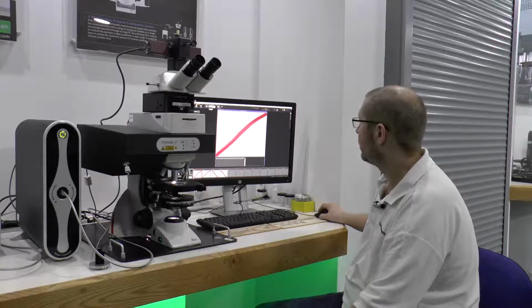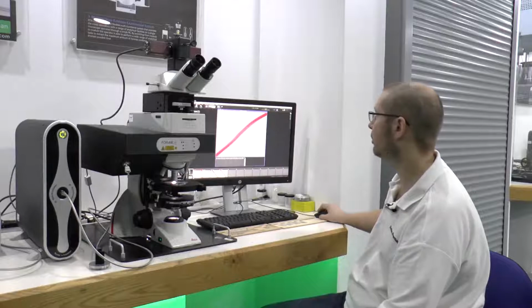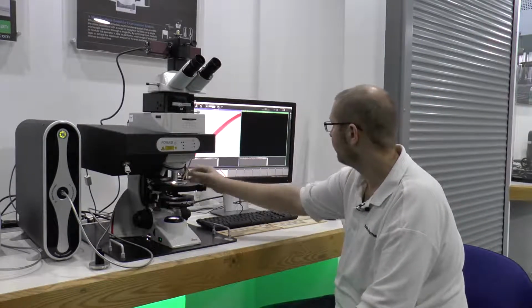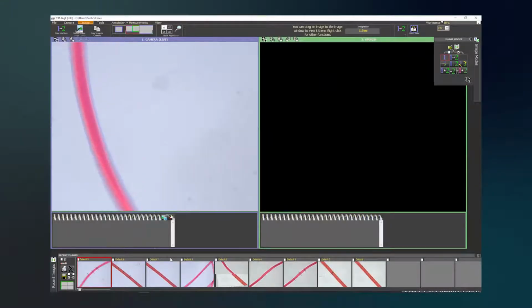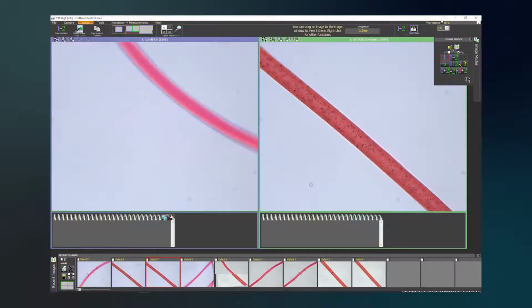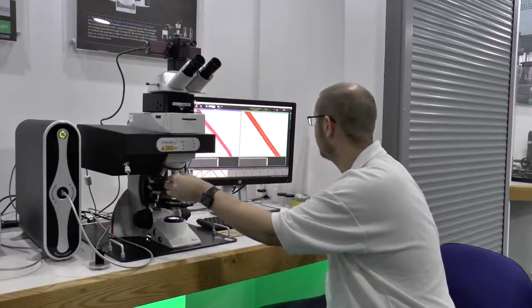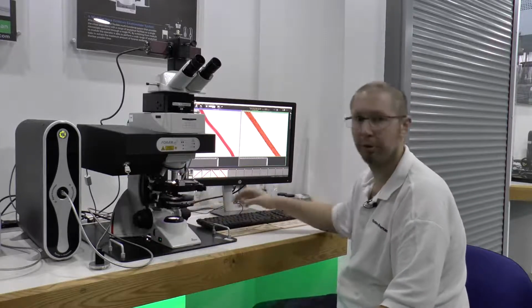And using the software, we can now do a side-by-side comparison as well of these two fibres. So we can switch to side-by-side. We can keep this one as our live measurement if we want, and then we just need to drag and drop our sample from the first examination over into our second window here. Because we've got it live, we can reposition our sample to be in a similar orientation to the one that we took before.